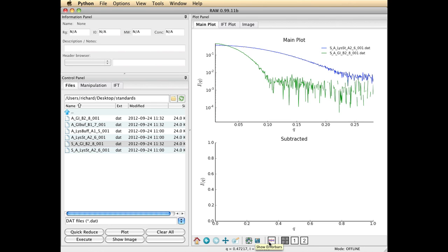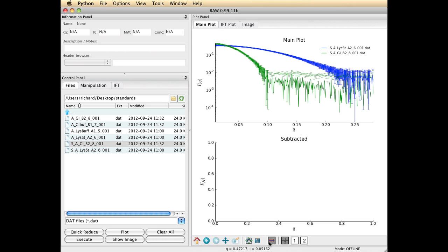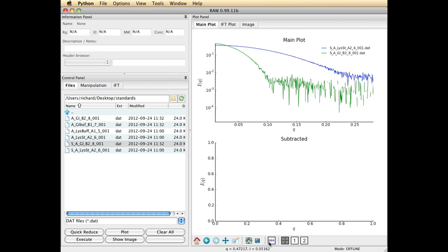This little icon here is show error bars and that's quite handy. You'll see the error bars are fairly close together. But it does allow you when you zoom in to see whether or not two curves are overlapping to within experimental error.